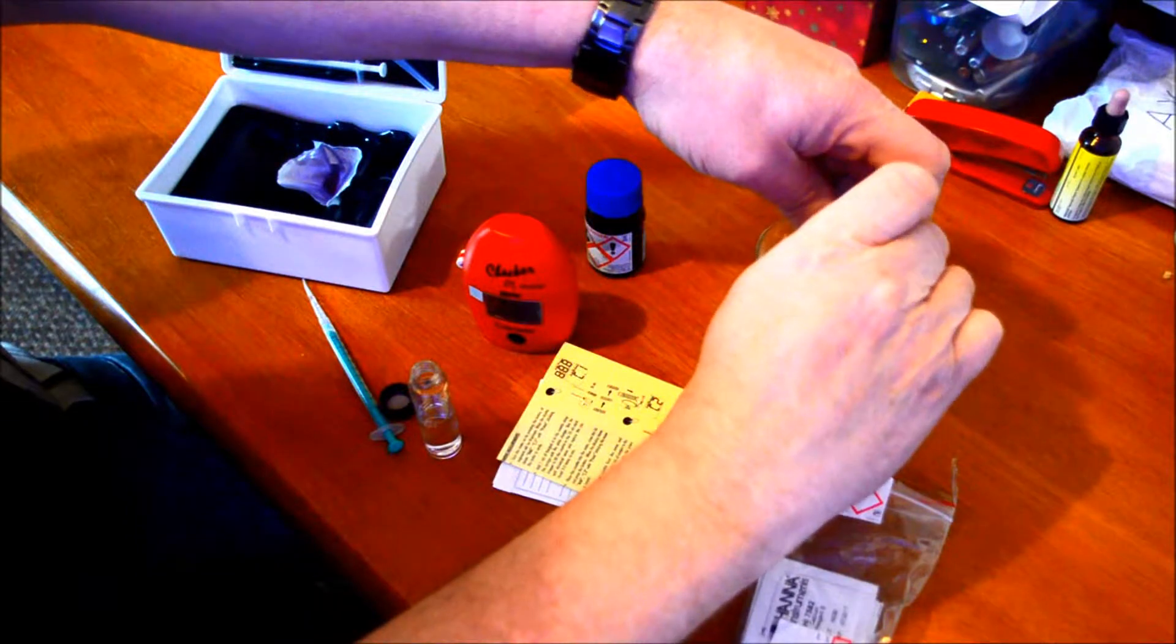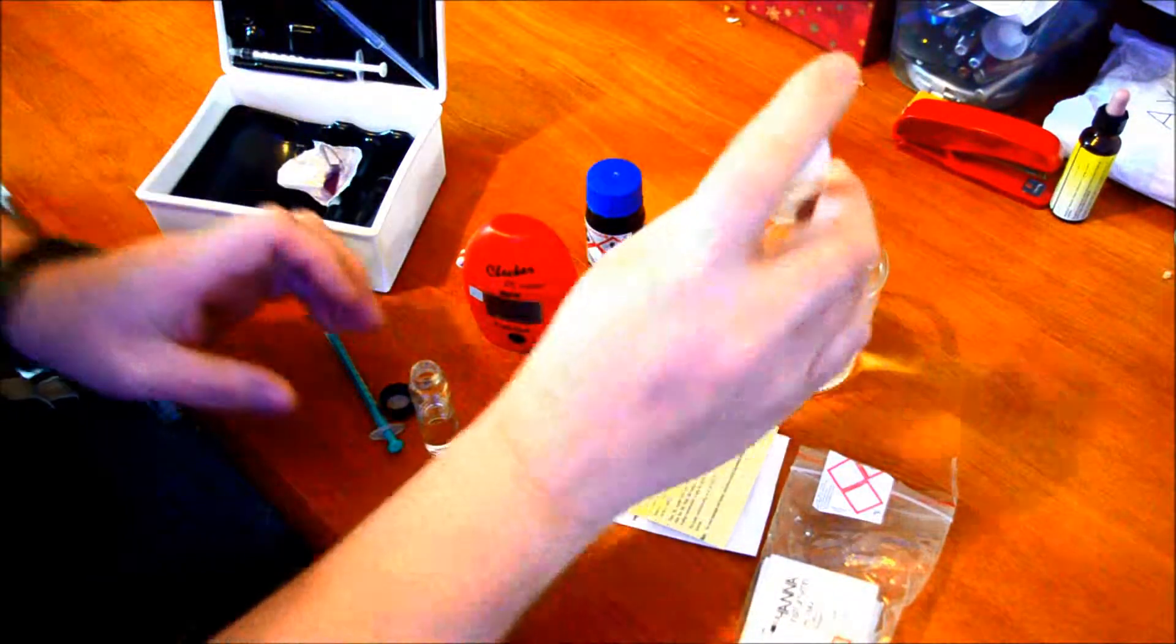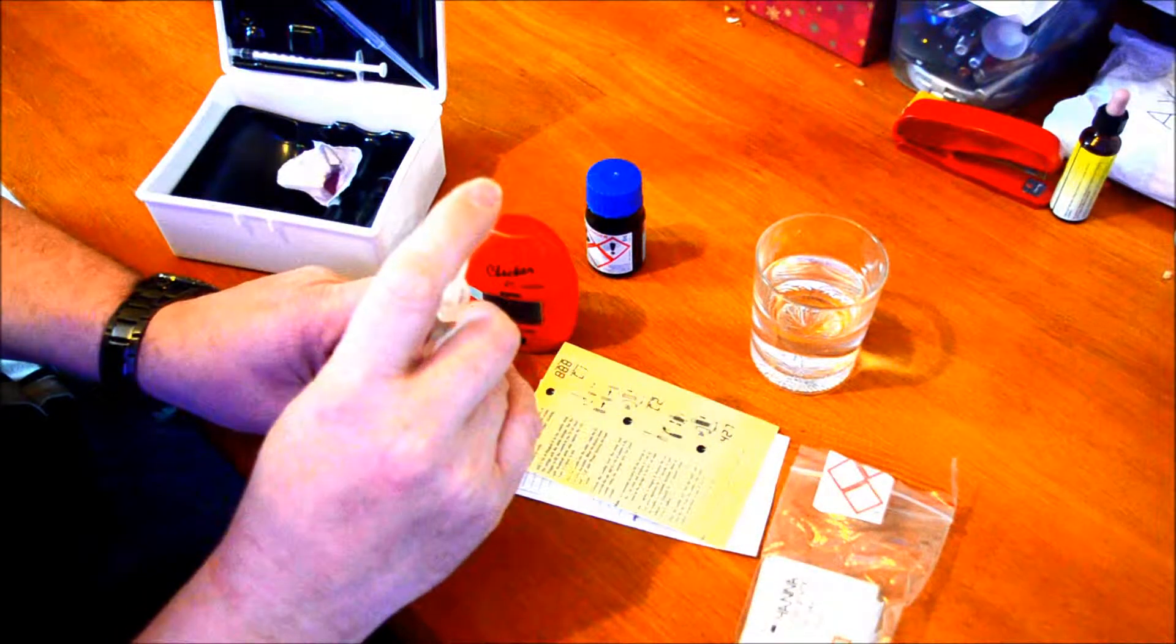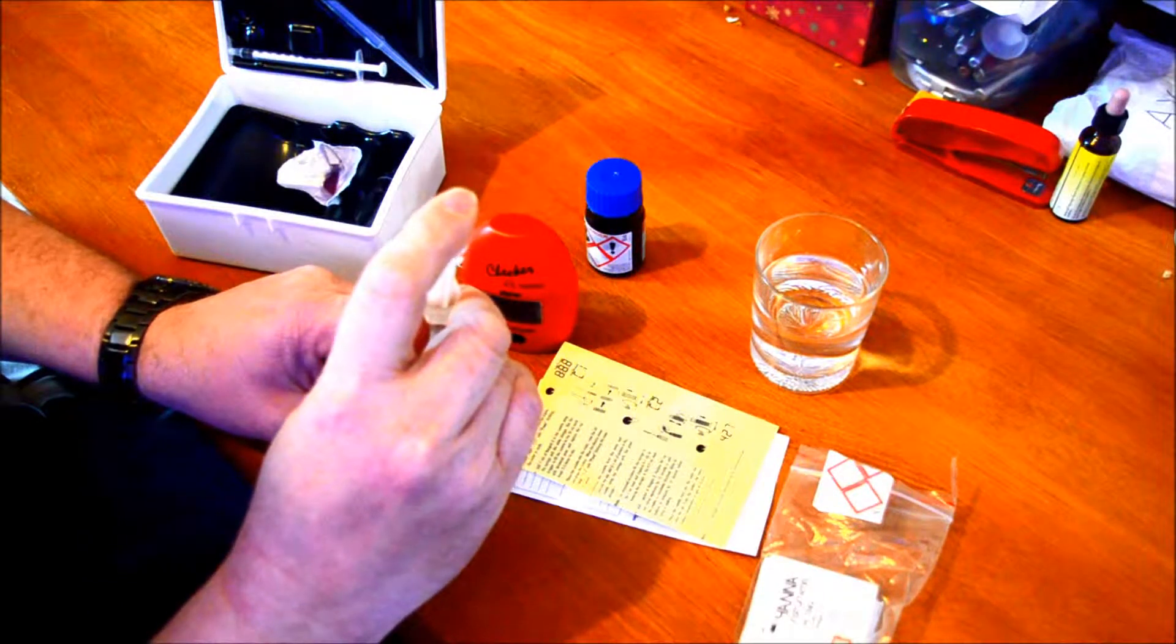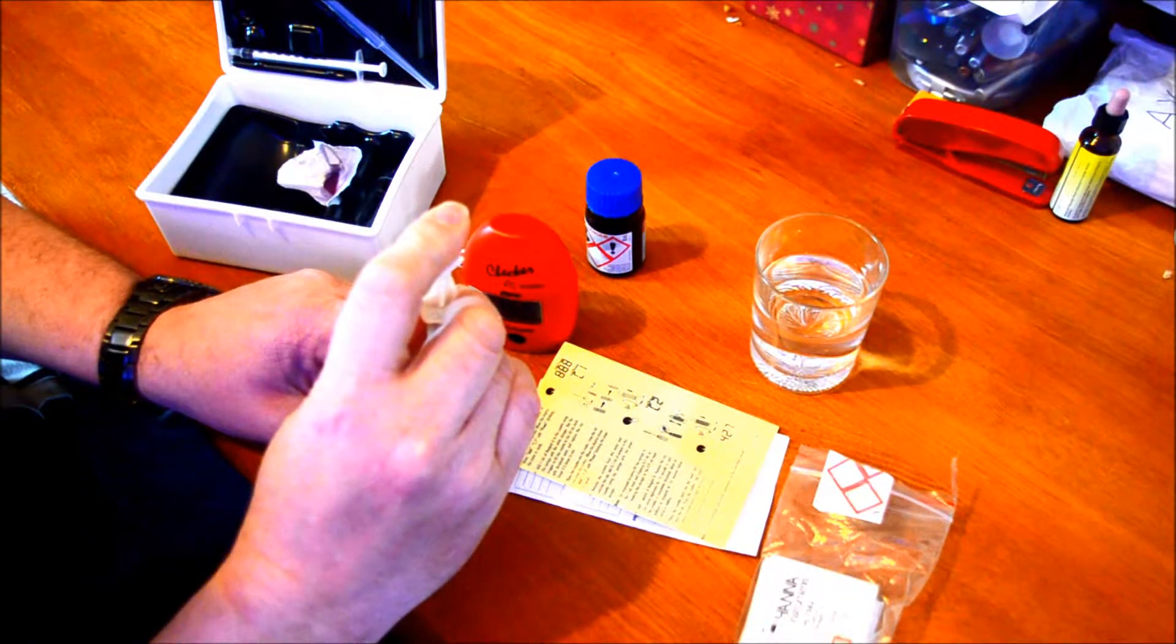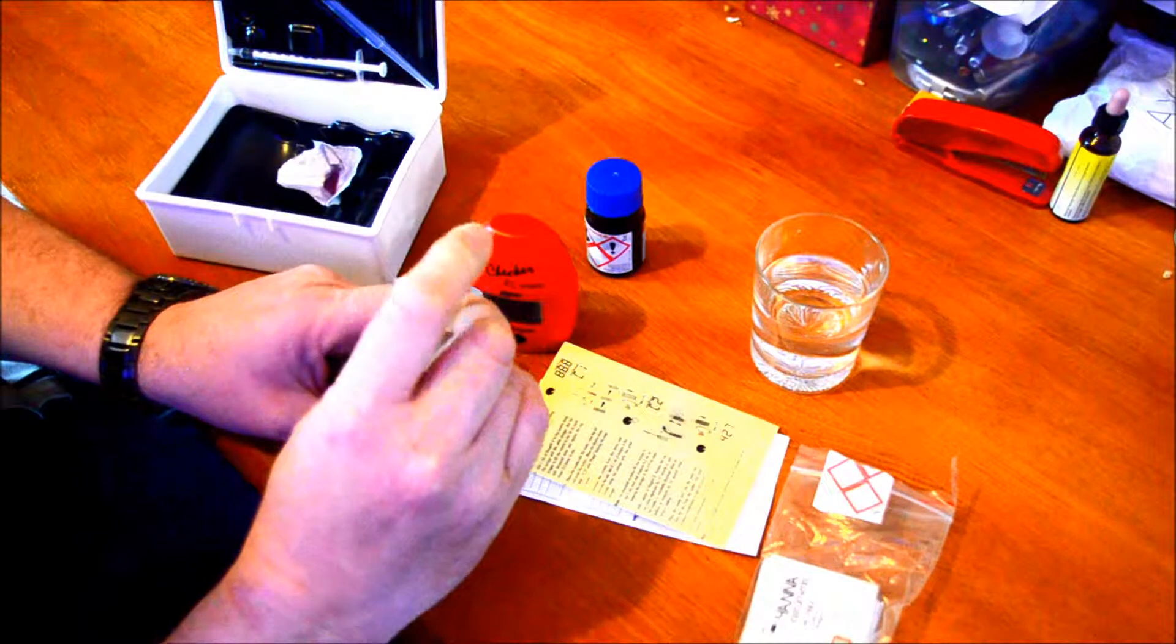Why I got this is because it's so accurate. You're still using chemicals and powders and stuff, but you're not using your eye to do it.